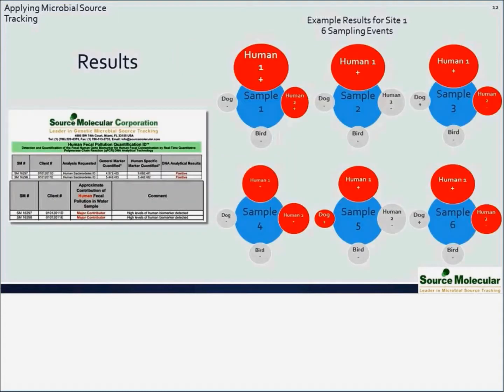So the results of microbial source tracking. On the left column, this is an example report, and what source tracking provides you are essentially two things. It tells you in a sample, was there human or not, was there dog or not, was there bird or not, was there any of those sources we tested for, were they present or not in the sample? That's the first element.